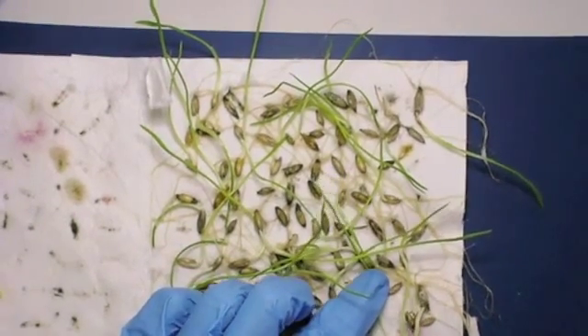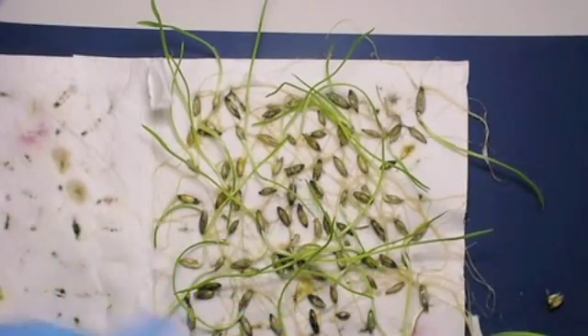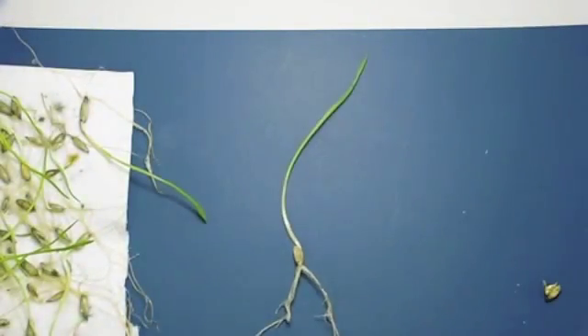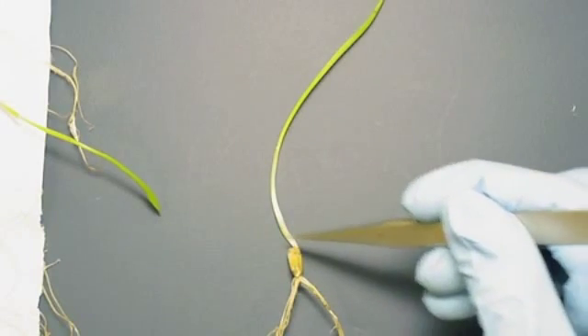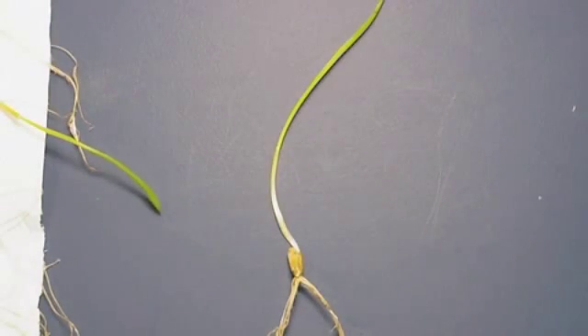I just want to recap to show you that on a germination test, when we talk about normal seedlings, we're looking for extremely good root systems, nice intact coleorhiza and coleoptile, good leaf structure, and a nice clean healthy-looking seedling.